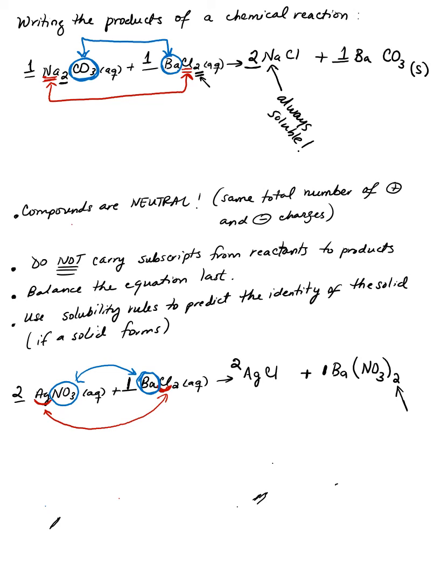Any positive ion that you combine with chloride, Cl-, is soluble, with the exception of chlorides combined with silver, lead, or mercury. If you have silver combined with chloride, that compound is insoluble in water. So your AgCl corresponds to the solid that you observe when you mix silver nitrate with barium chloride.